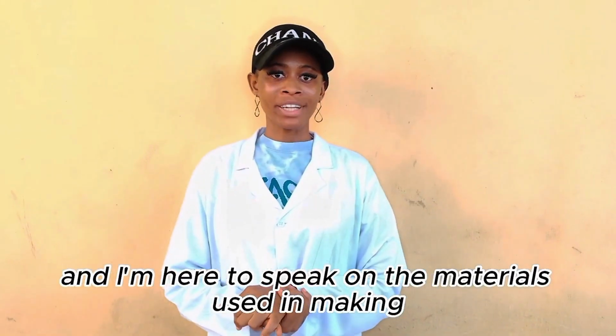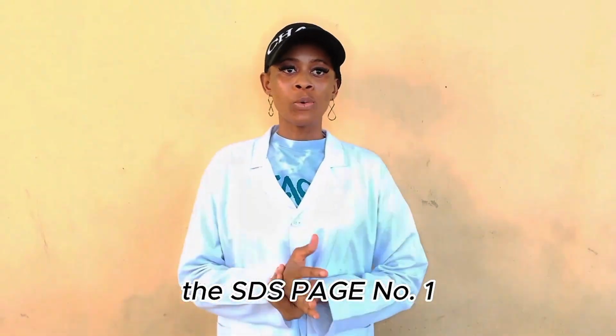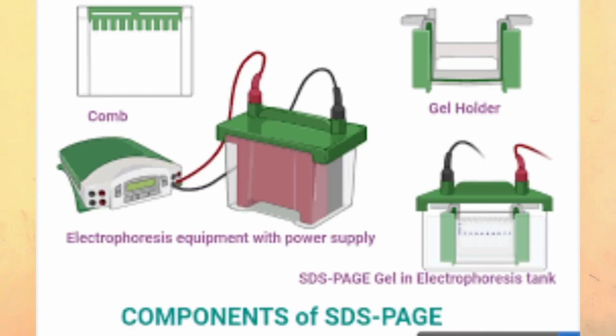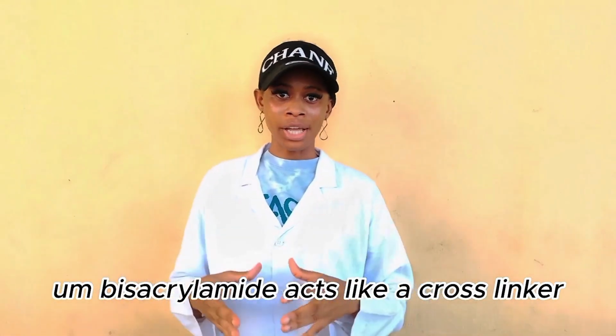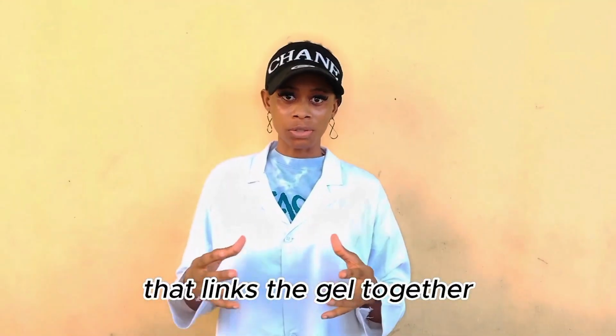Now I'm here to speak on materials used in making the SDS page. Number one, we have the acrylamide and the bisacrylamide. The acrylamide makes the gel, while the bisacrylamide acts like a cross-linker that links the gel together.